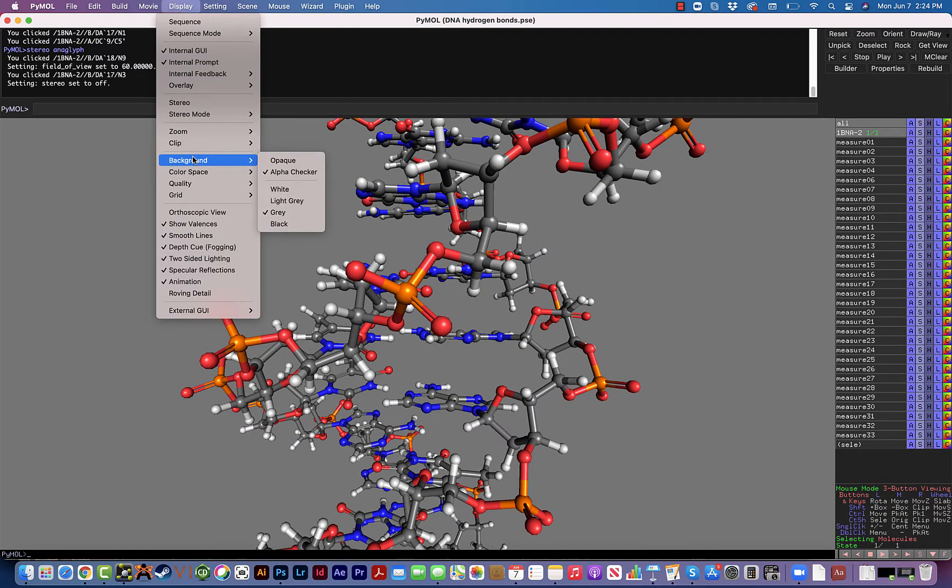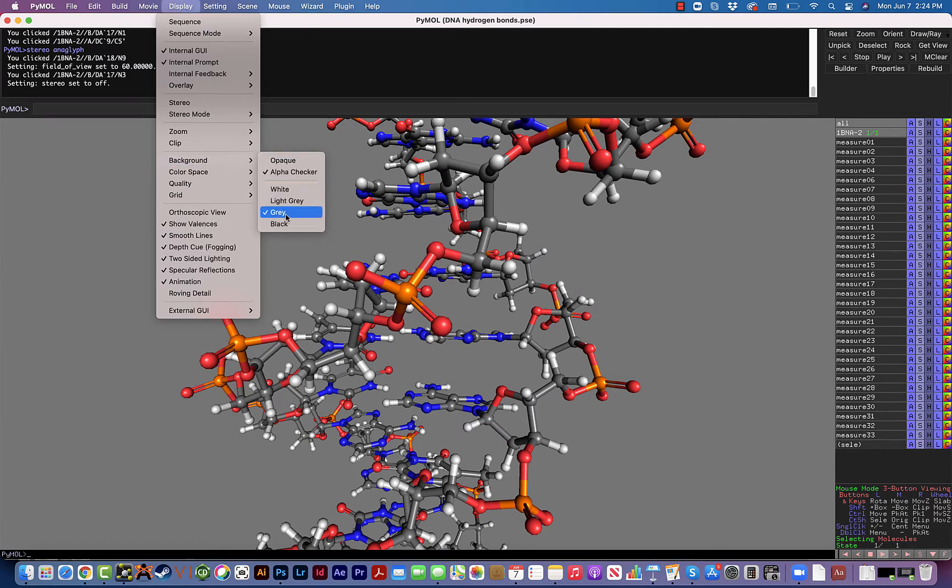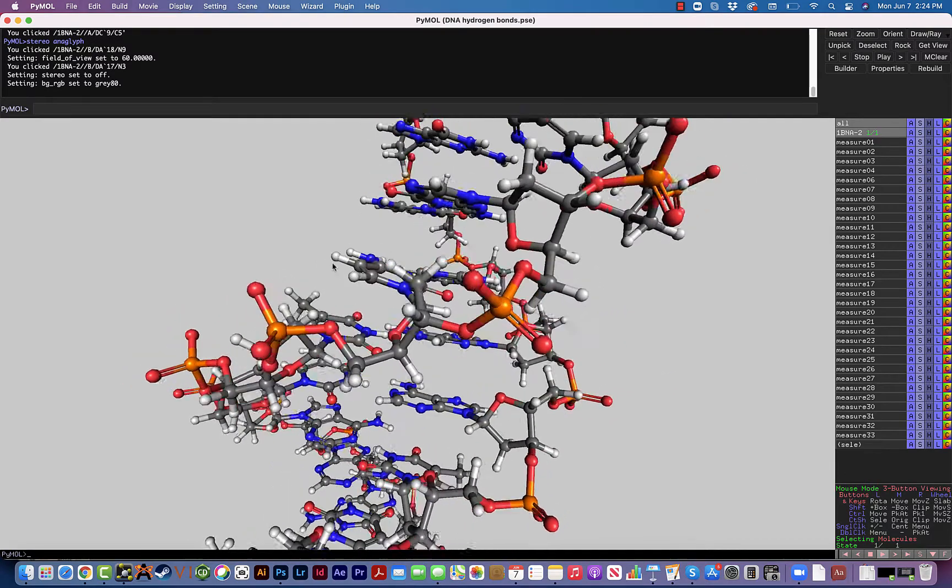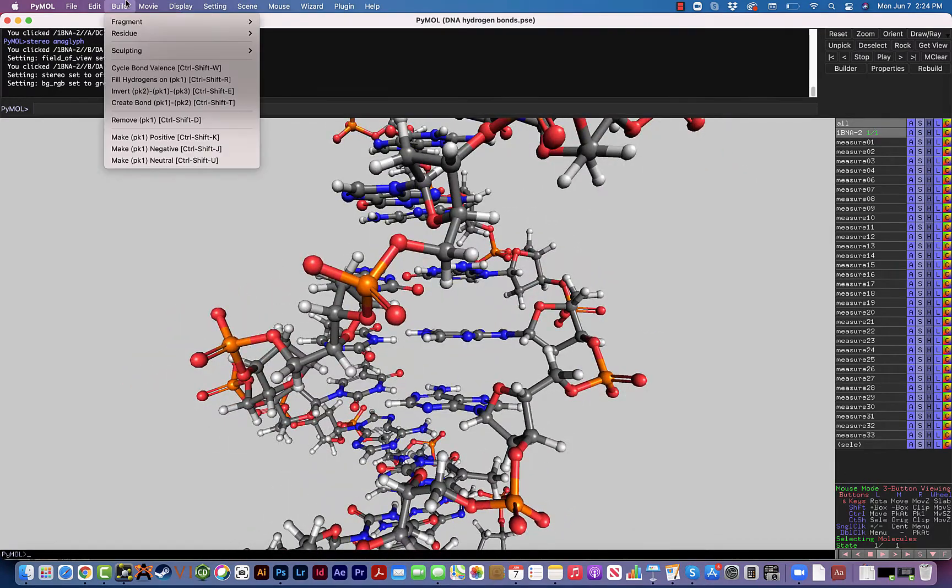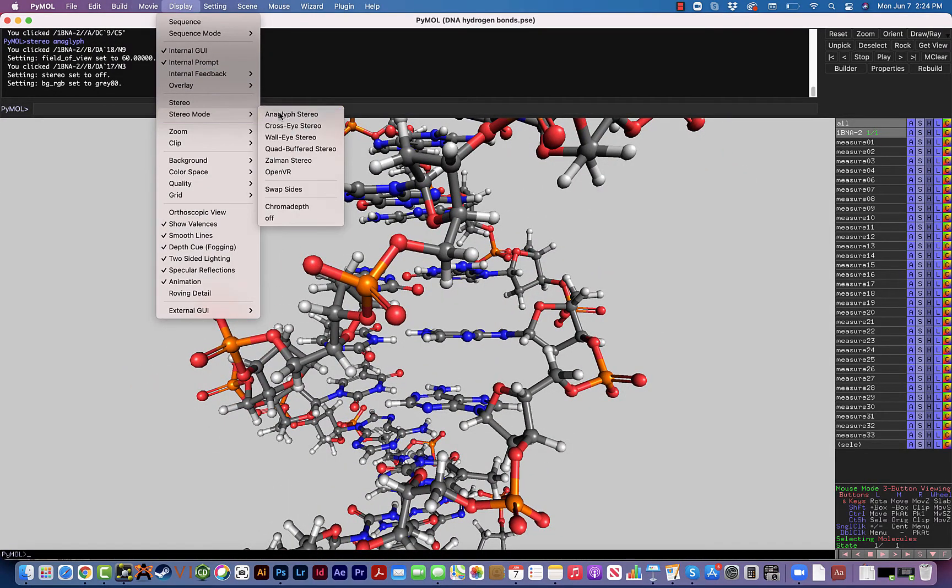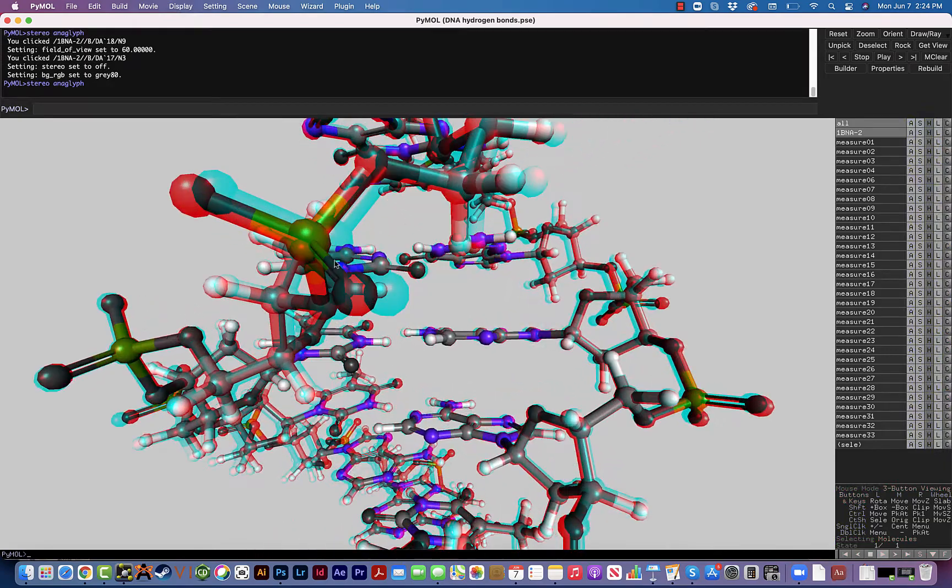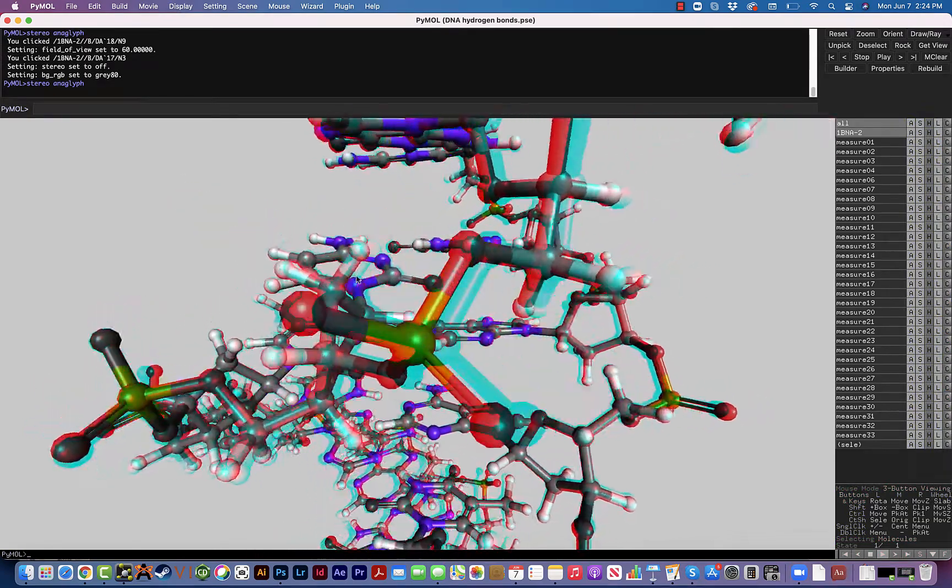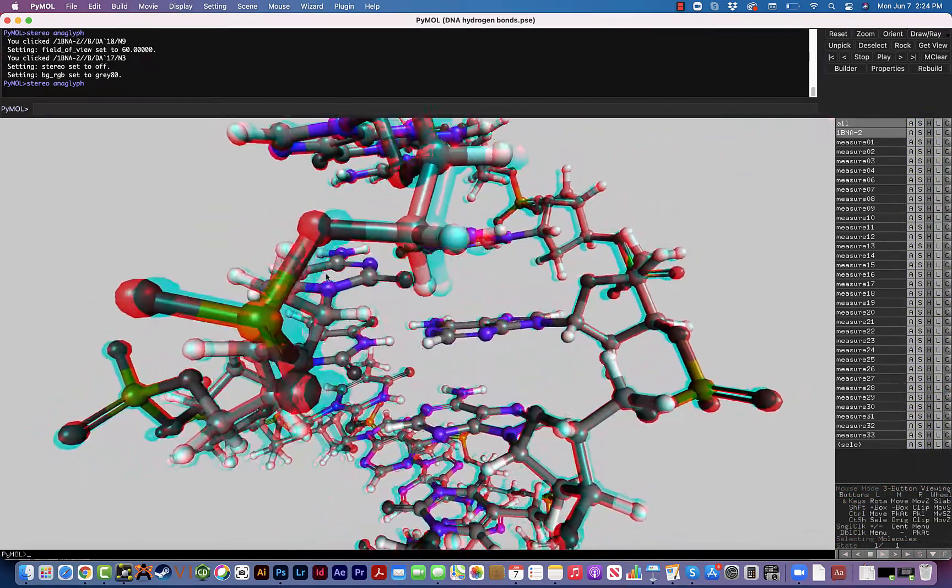So if you want to do that also, you can go to Display, Background, and then you can select different colors - you can do white and black. The gray or light gray are usually better for doing the stereo views because it creates a little bit more contrast because of the way the colors work.